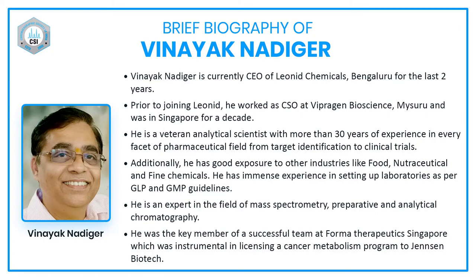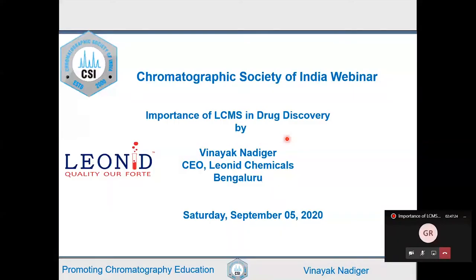So today's presentation will be on the importance of LCMS in drug discovery. As the society's name is Chromatographic Society of India, a chromatographic technique standalone sometimes will not be able to give you complete information. It was fine during the HPLC days, when only HPLC was there. But what you should know is there was a UV component there, which is a detector.